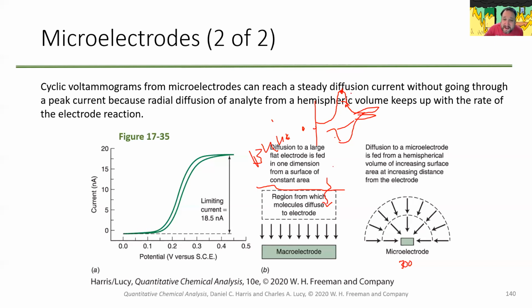So yeah, you see this curve in here because you run out of room. You run out of stuff at that surface. In our microelectrodes, we don't have the corresponding curve on the duck's head because you don't run out of stuff.